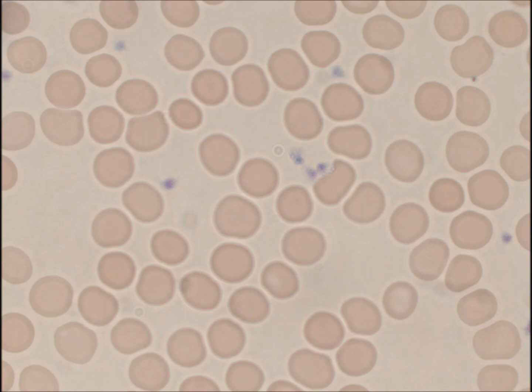Here's another image of a potential Bartonella. If we look at that red blood cell in the upper right-hand corner, you can see again a darker spot. It looks much different than the other purple spots, which we'd call platelets. It's on the outside of a red blood cell where it's supposed to be, as location would usually indicate for Bartonella. Its size and shape are about right, and it's got a hard outer line defining where it's located.